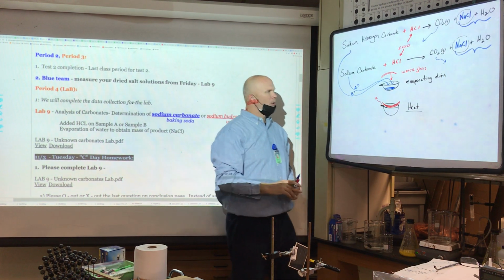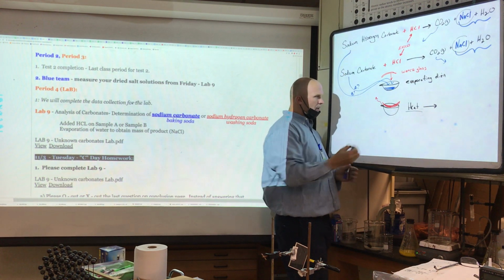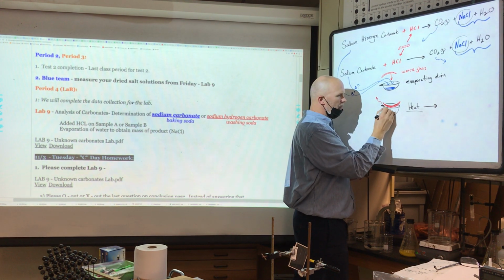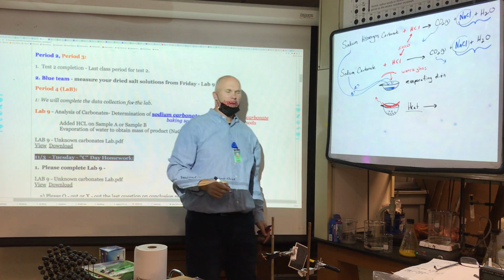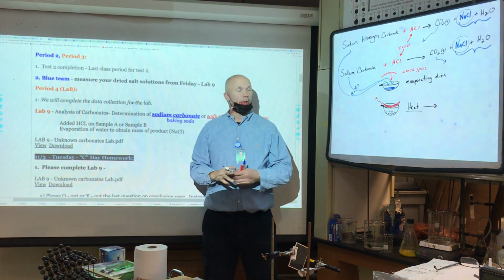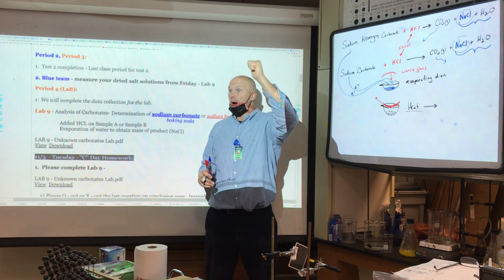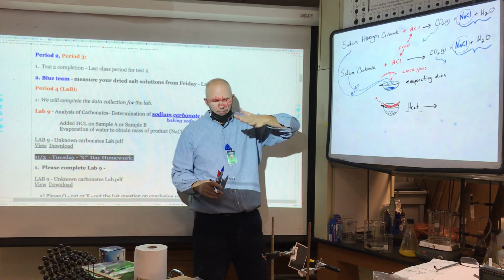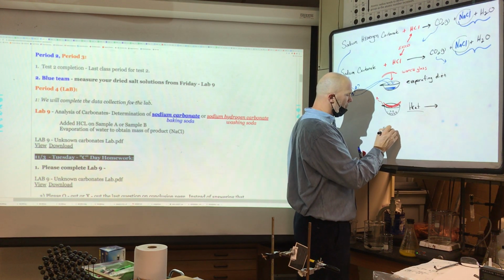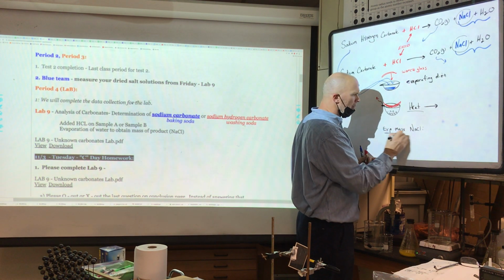So we're going to heat for a while, and then we're going to basically have crystals of sodium chloride, on the top too. It won't be black. Once it's dried, in about 10 or 15 minutes, and once we cool it, we're going to subtract out the dry evaporating dish and the watch glass, and you will get your experimental mass of NaCl in grams.